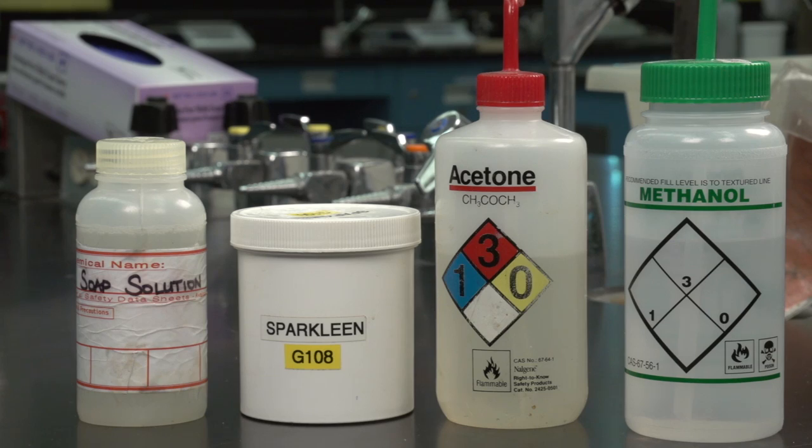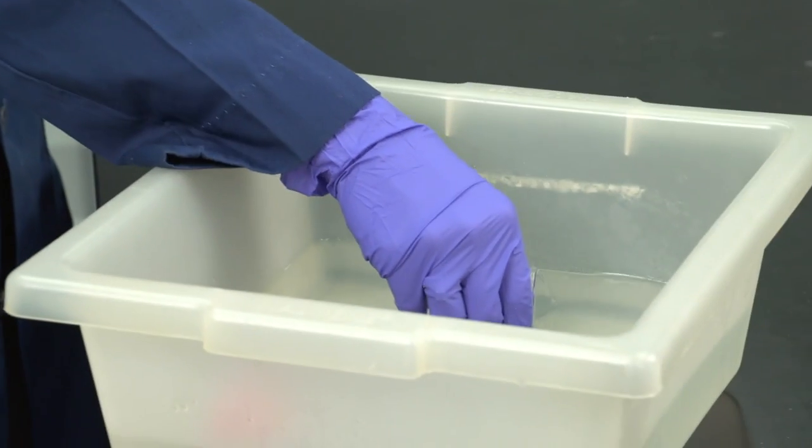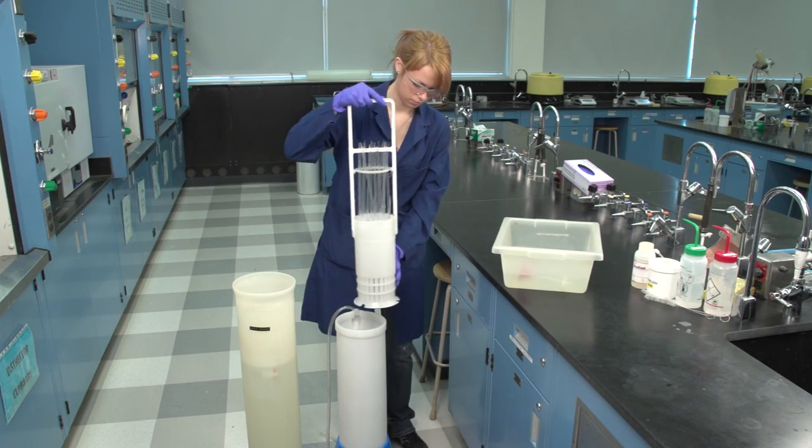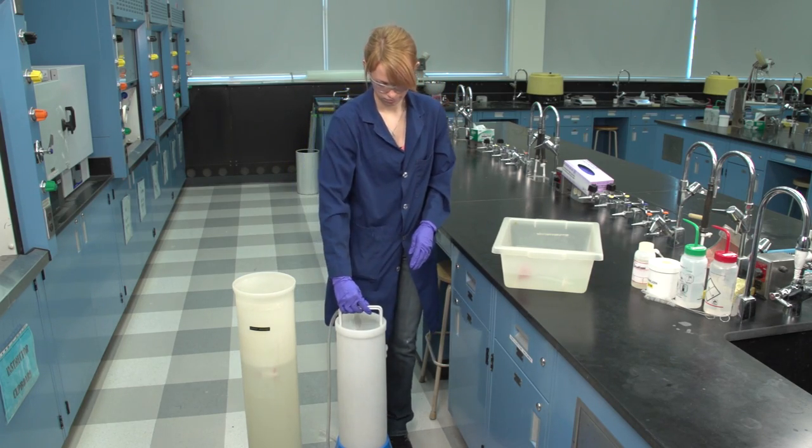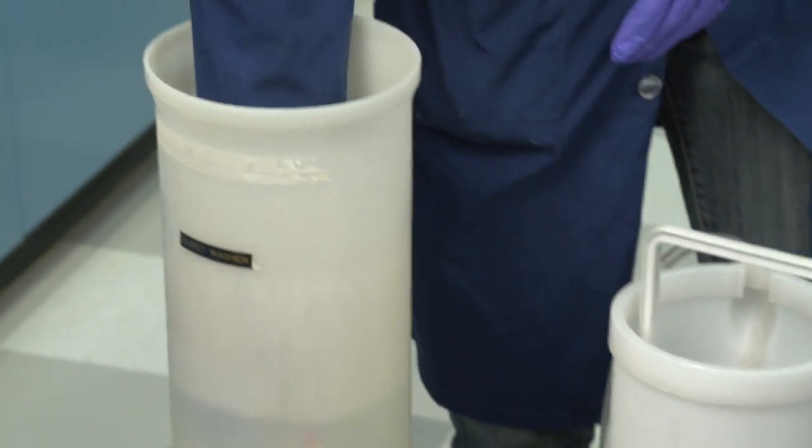Soap, detergent, or abrasive powder may be used for washing glassware. To remove stubborn stains, soak the glassware in a detergent solution. The soaking process can be either hot or cold and can continue for extended periods of time.